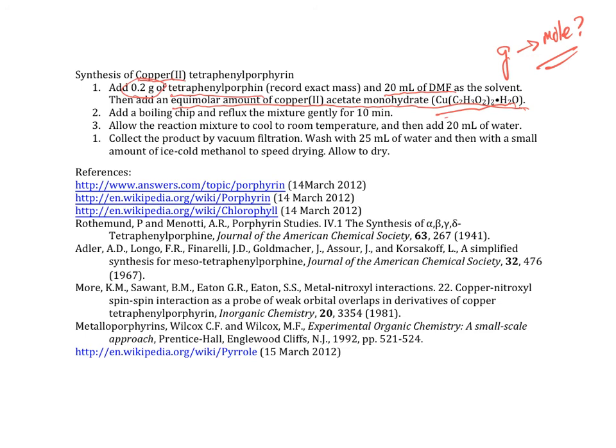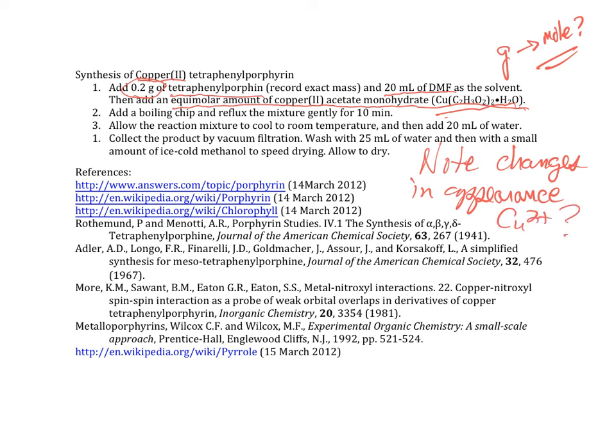We will reflux this gently and collect the product. And we hope that we can note changes in appearance after we add the copper 2. Right?